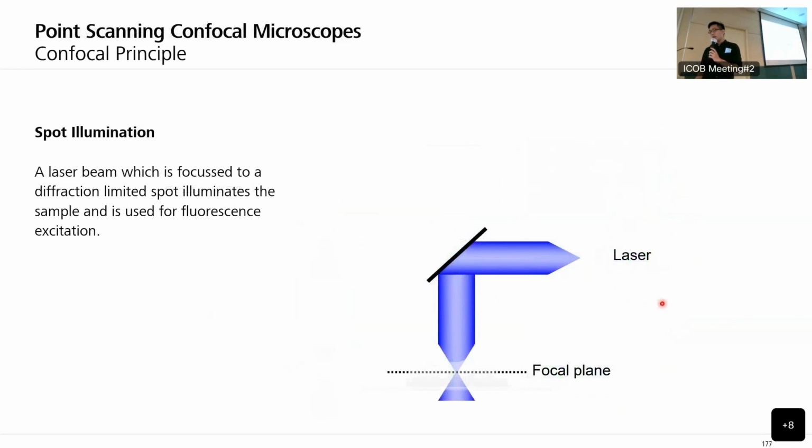This is why we need to use a laser light source for the confocal microscope, because a laser has much more intensity, so it can penetrate through the samples into deeper parts. Also, laser light scatters less compared to LED lights.